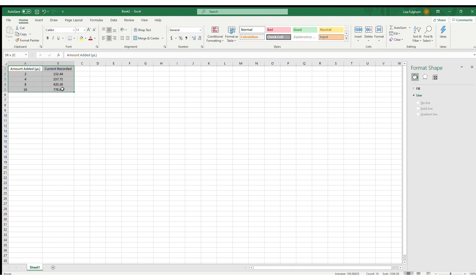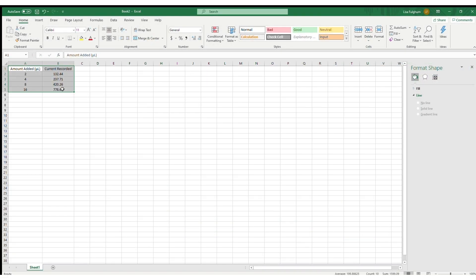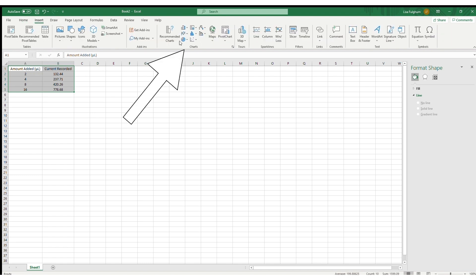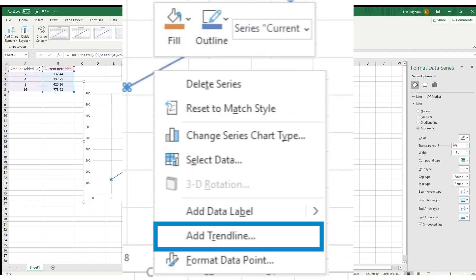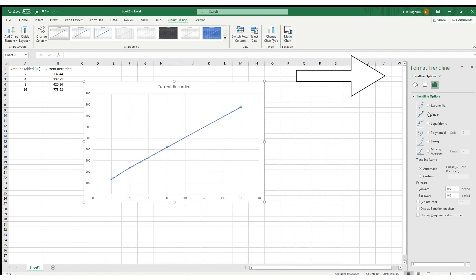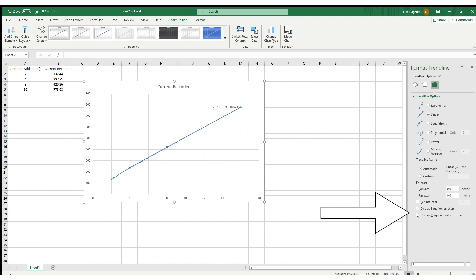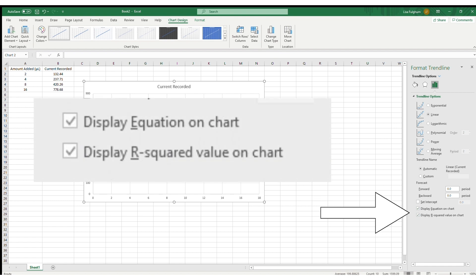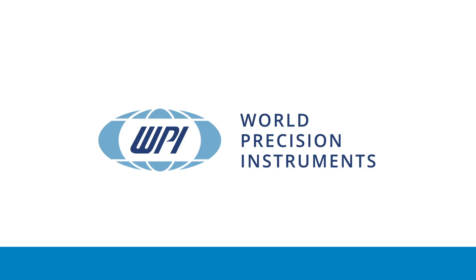Using Microsoft Excel, generate a linear regression analysis that will display the equation and the R squared coefficient. To do this, enter the data points we just defined and generate a scatterplot graph. Then select the line, right click, and choose Add Trendline. The Format Trendline option appears. Set the trendline option as linear and select the Display Equation on Chart and Display R Squared Value on Chart checkboxes. After performing this calibration, the sensor is ready for use.